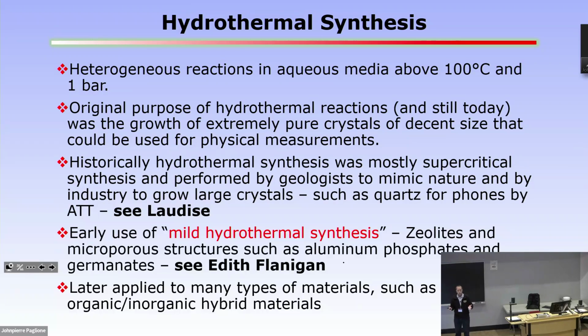The original purpose of hydrothermal reactions, and still today, was to grow really pure crystals, and in many cases of a decent size. And by decent size, we're talking something like this. So big crystals. The geologists were really interested in it because it mimics nature. They could grow things that were found in nature.